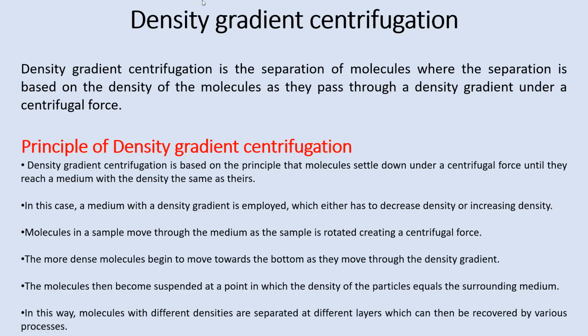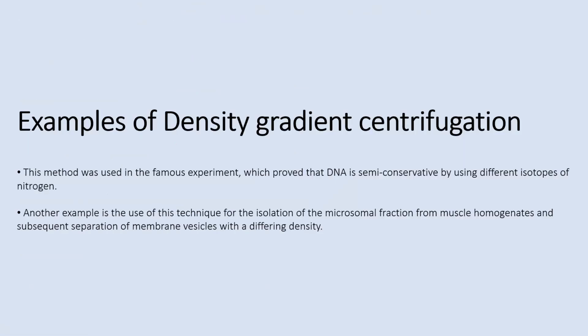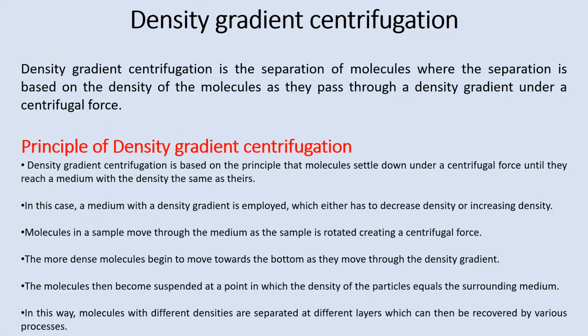There are different types of centrifugation, such as density gradient centrifugation. In the further slides, there is a lot more about, say, sucrose. How do you use sucrose for doing a density gradient centrifugation? This we will see in the next class.